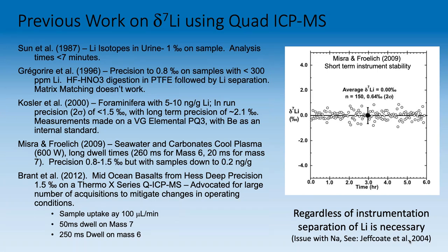And again, what people did to try and deal with the matrix is they lowered their RF. They were trying to kill the matrix by using a lower RF so that they weren't ionizing anything but the easily ionized. Unfortunately, sodium is also easily ionized. So part of the issue is that if you have a high sodium sample, it sticks to things, it slows down the lithium, it becomes a mess. So ideally, yeah, separation seems to be the way to go.